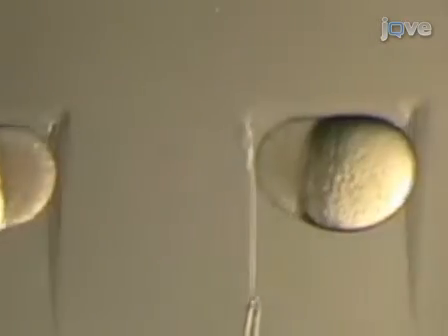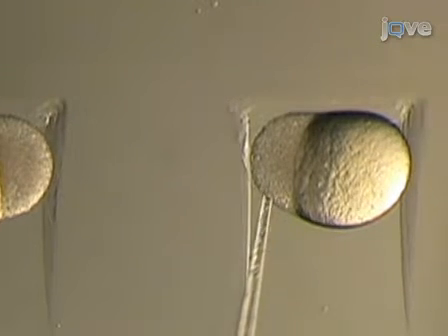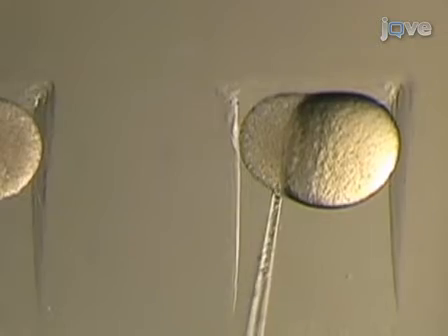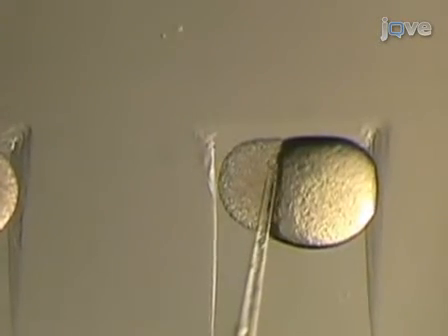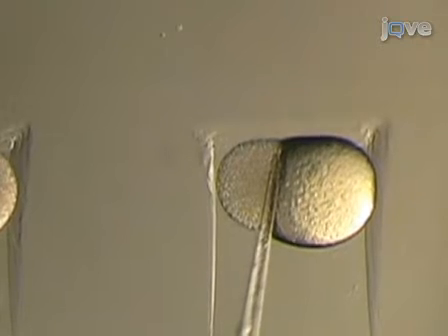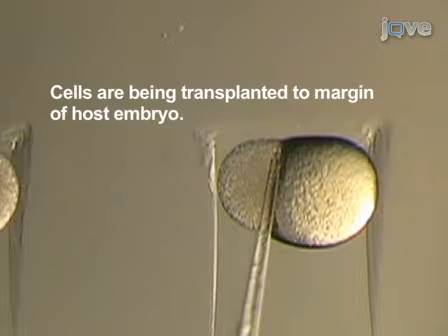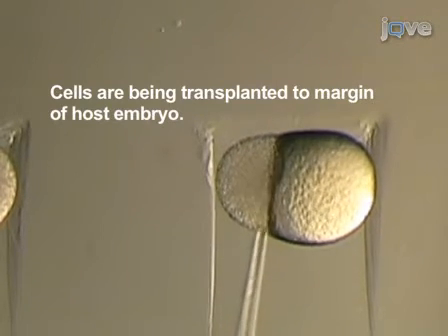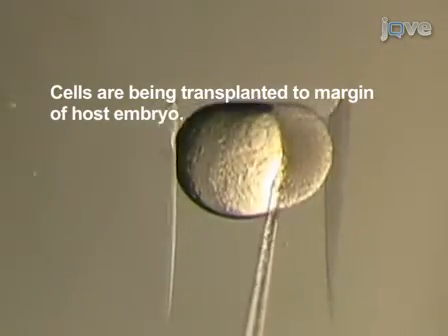Bring the host embryo into position by moving the transplantation dish. Small adjustments to the position of the host embryo can be made by gently turning it using the transplantation needle, as long as care is taken to not touch the yolk. When expelling the donor cells into the host embryo, avoid taking yolk up into the embryo, as this will damage and kill the donor. Cells from a single donor embryo can be transplanted to multiple hosts.